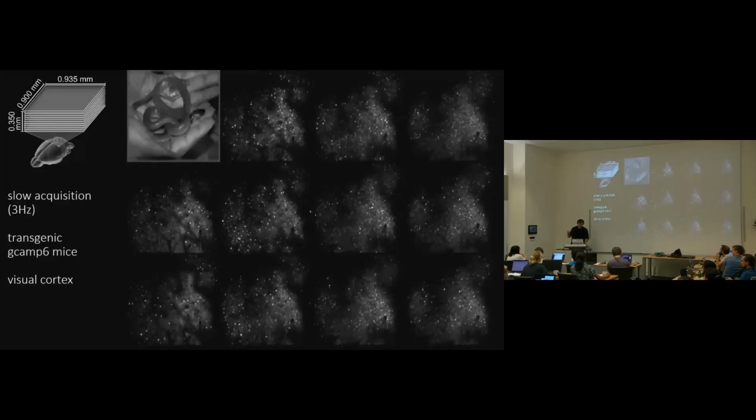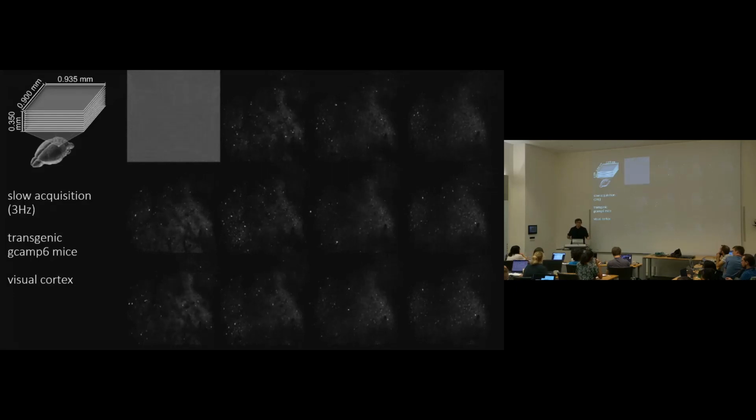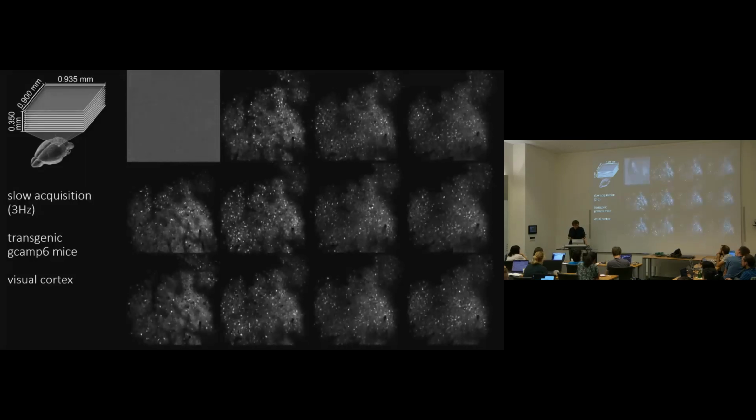So that's really what we primarily developed this for, but of course along the way, since everyone's data sets are not that different, it turned out it's a good tool to use in all sorts of scenarios.